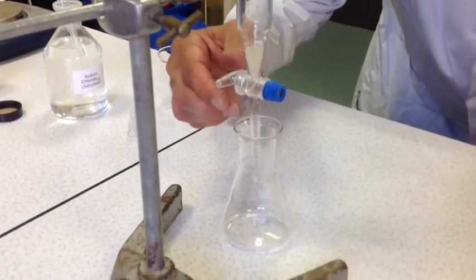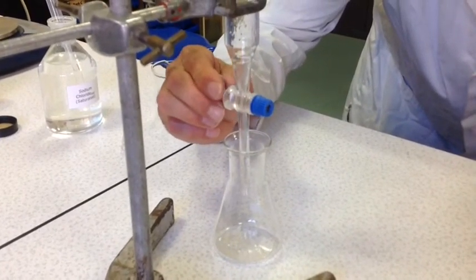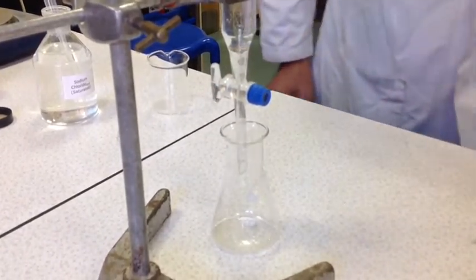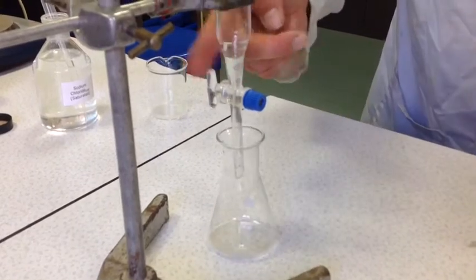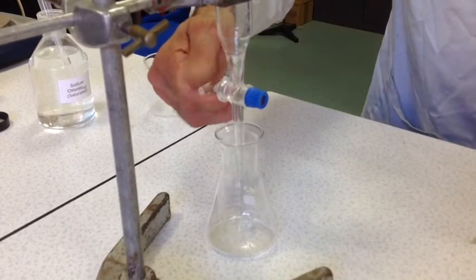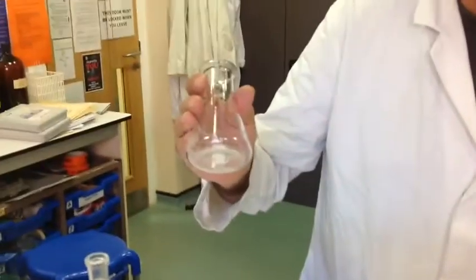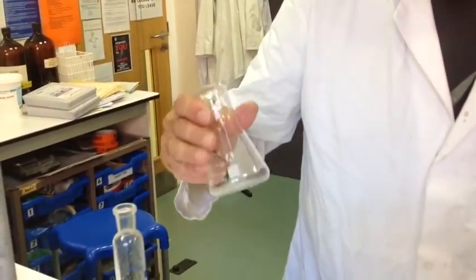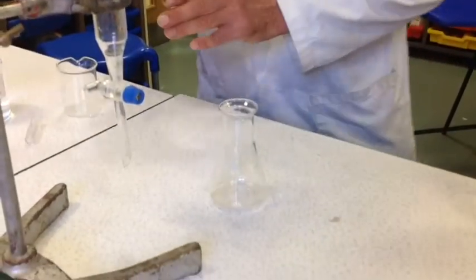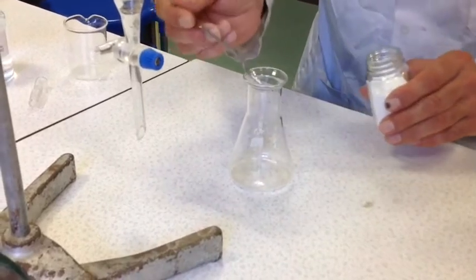Okay, so the cyclohexene is now transferred into a conical flask. And just give that a few seconds to thoroughly run out. When you're happy it's all in the flask, close the tap, and we now have to dry the cyclohexene. To do this, we are going to add a few lumps of anhydrous calcium chloride to the conical flask. It doesn't have to be much, just a small quantity.